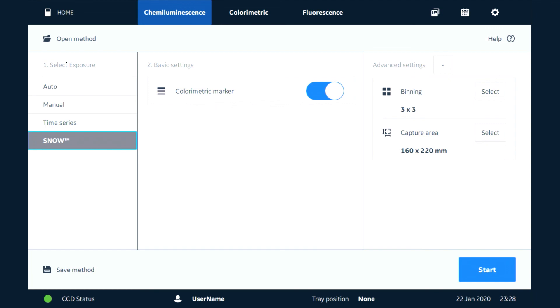Once you've selected all the settings you want to use, we're going to press the start button here for image capture.